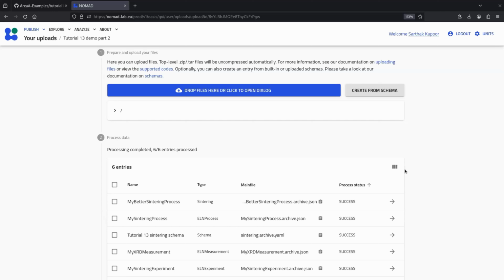So this is exactly what I will explain in part 3 of this tutorial. Then I will show how we can develop a plugin where we can really do this to a custom file and read it and so on. So it's to come. Exactly. And I'll show a little glimpse of what a developed plugin would look like.